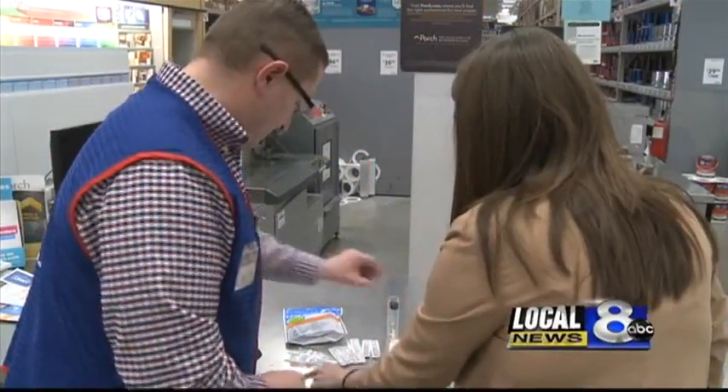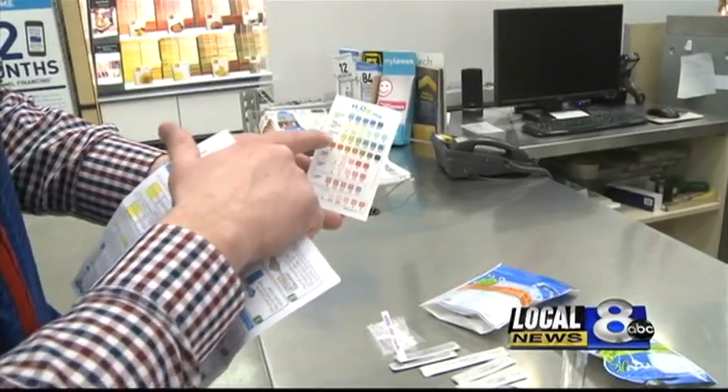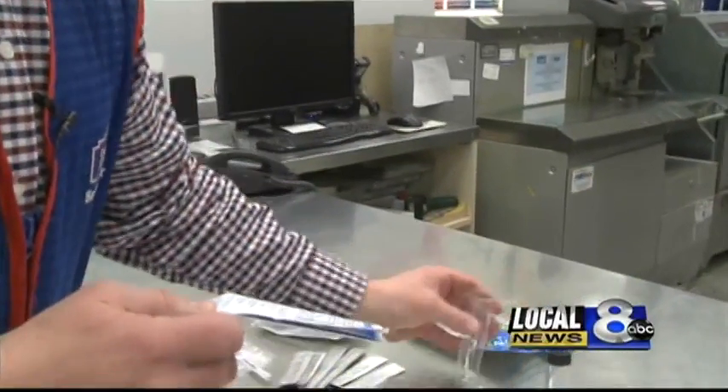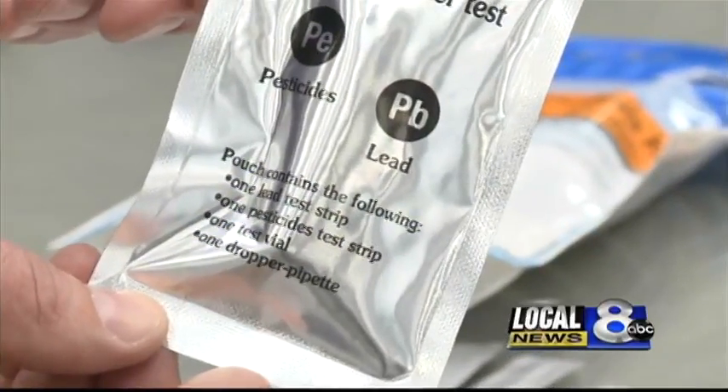And you have this color chart which tells you — correct — the different colors and the amounts for each one. These kits test for a number of things like copper and iron. There's one lead test strip inside of this, and one pesticide test strip.